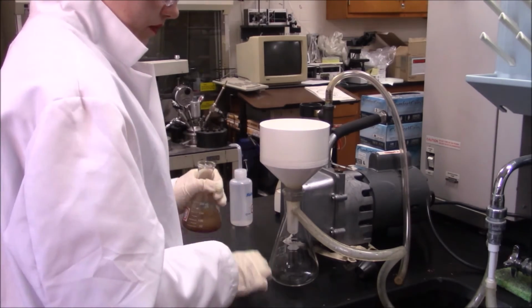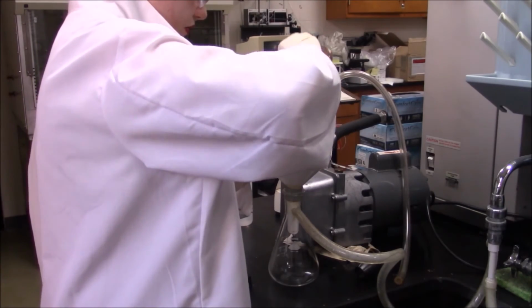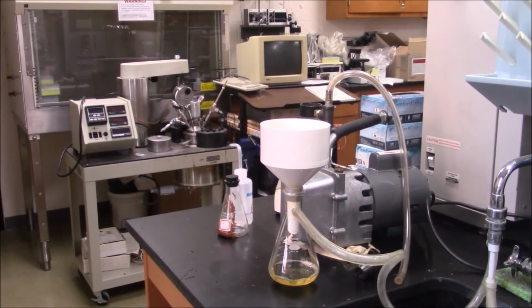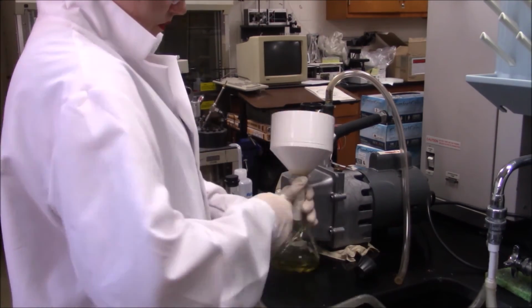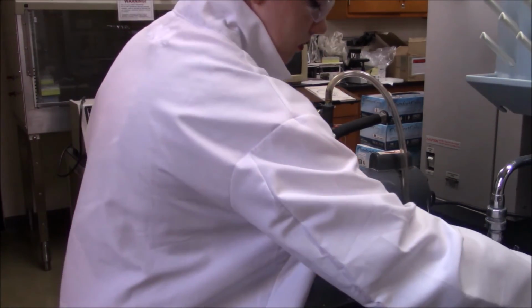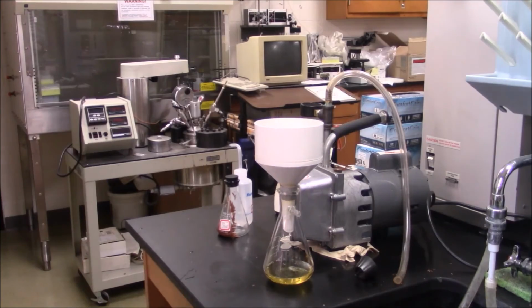After attaching the sink suction device and turning on the tap, pour the solution through the filter paper. Once all liquid has filtered through, first remove the hose from the Buchner flask, then turn off the sink suction device. Only the solution remaining in the Buchner flask will be used for distillation. If necessary, the solution may be stored in the refrigerator until distillation can be started.